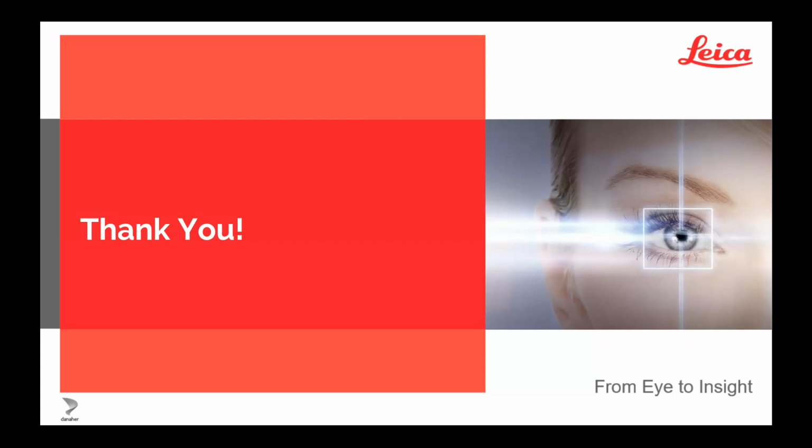acetone, I really only see once in a while as a transitional fluid. Again, it might be a bit more common on the material science side versus life science, but I can't really say offhand which samples would call for acetone. In my experience, it is mostly ethanol as the option.